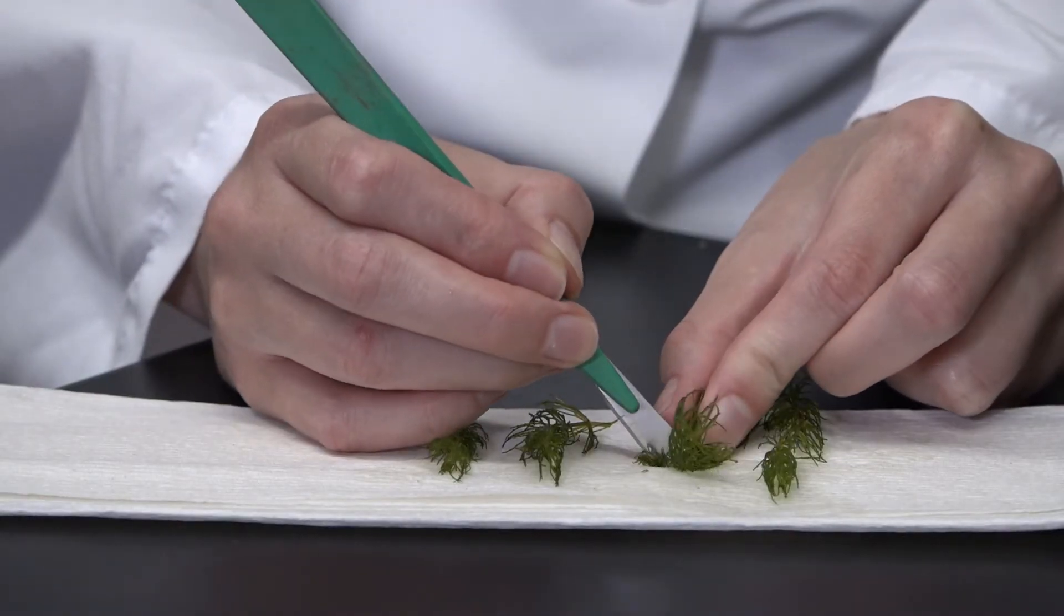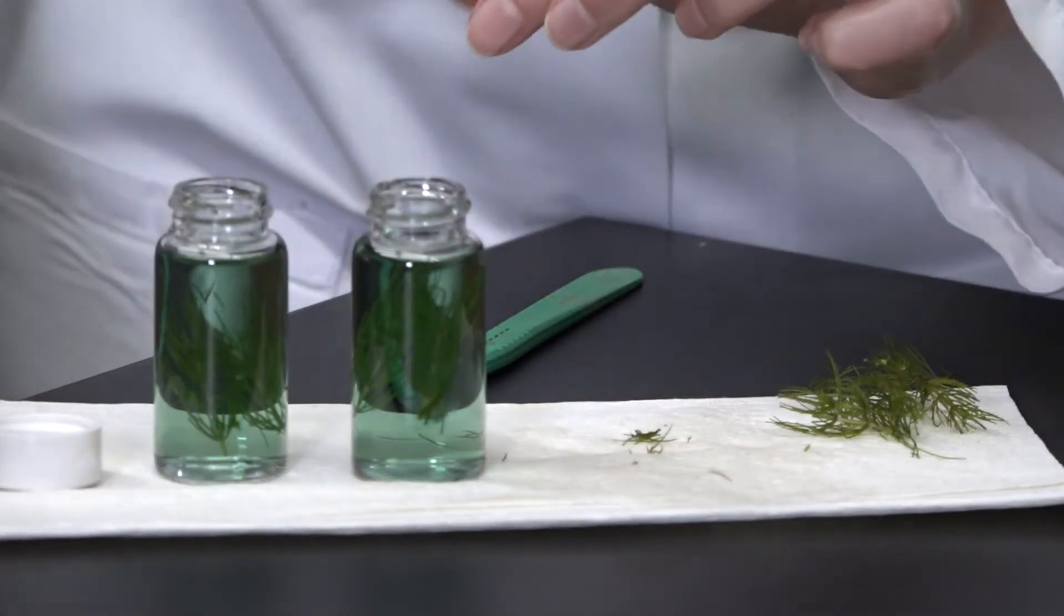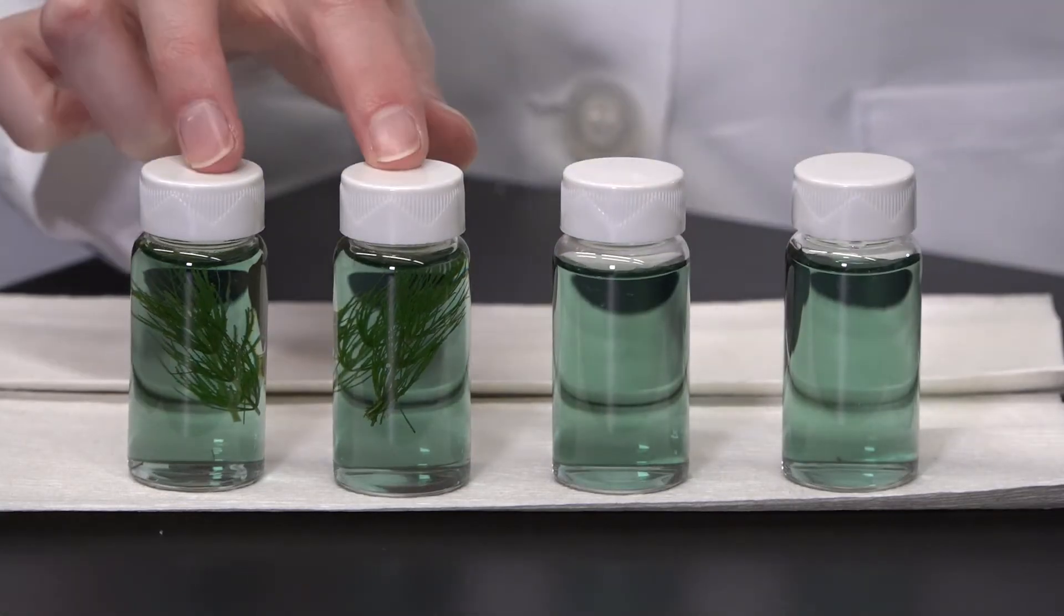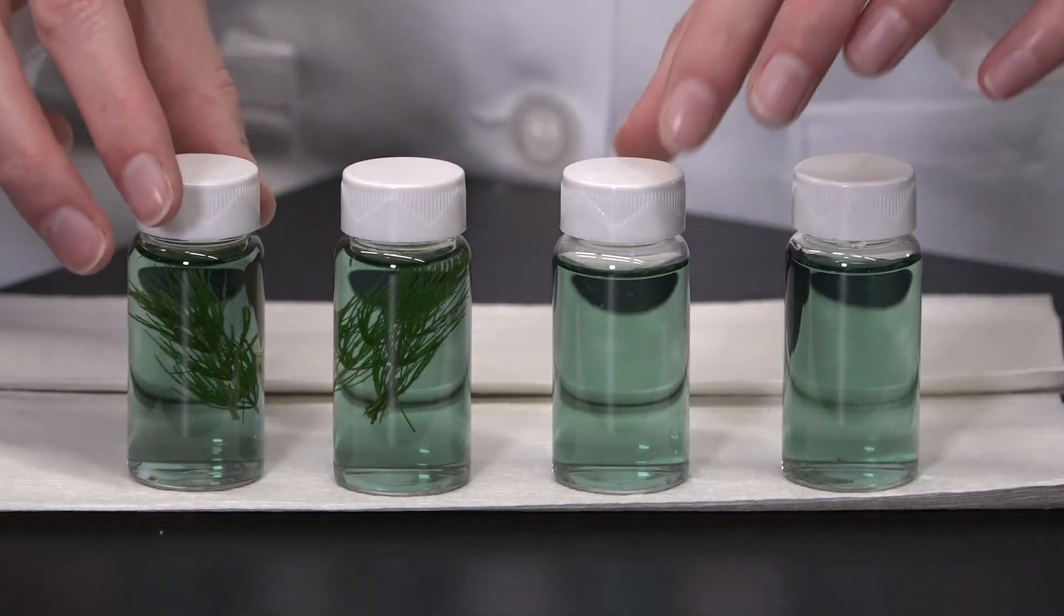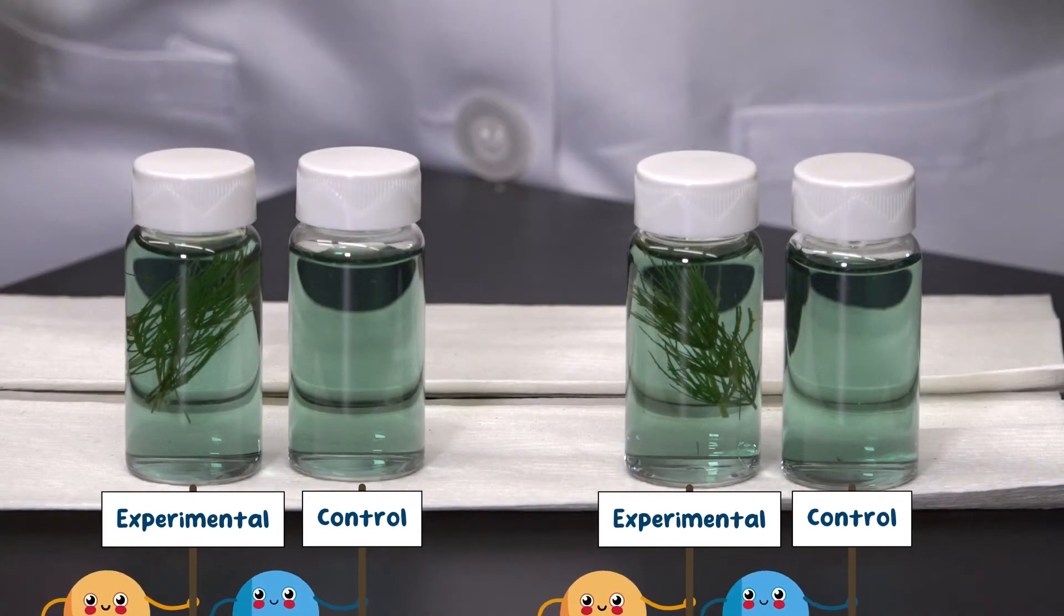Next, cut up four pieces of ceratophyllum so they're about the same length, and put two pieces into two of the vials, leaving the other two empty. We now have two empty vials and two plant vials. We're going to do two experimental treatments, one on each plant vial, and the empty vials will serve as the controls.